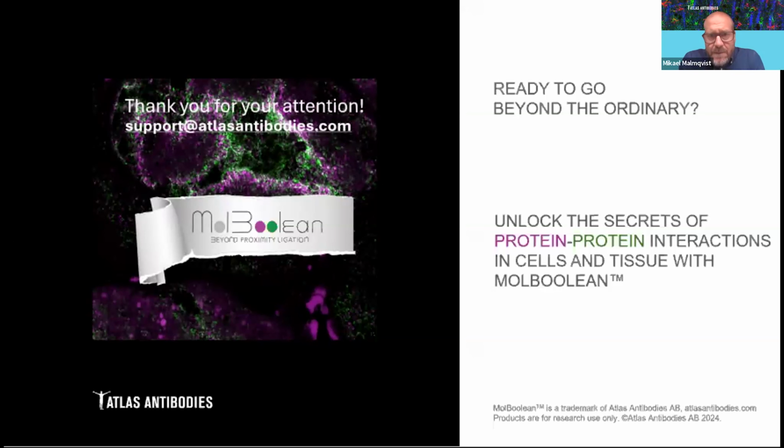Thank you, Ola. Let's have a look here. Stephanie's writing, hello, thanks for a nice talk. How do you link the oligos to the antibodies? Do you know the number of oligos per antibody, and does this matter? And do you see a difference between using primary or secondary antibody probes?